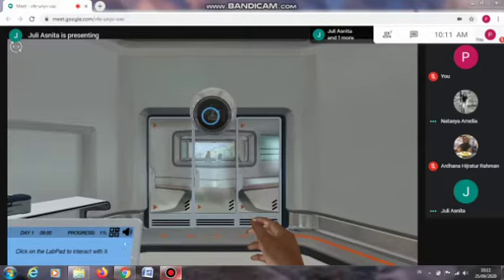Welcome to the lab safety simulation. I am Dr. One, your AI lab assistant. Today, you will learn everything you need to know to survive your first day in the lab. Are you ready for the challenge?